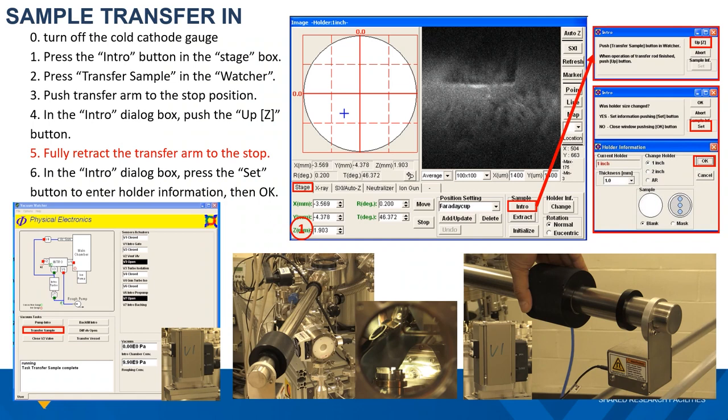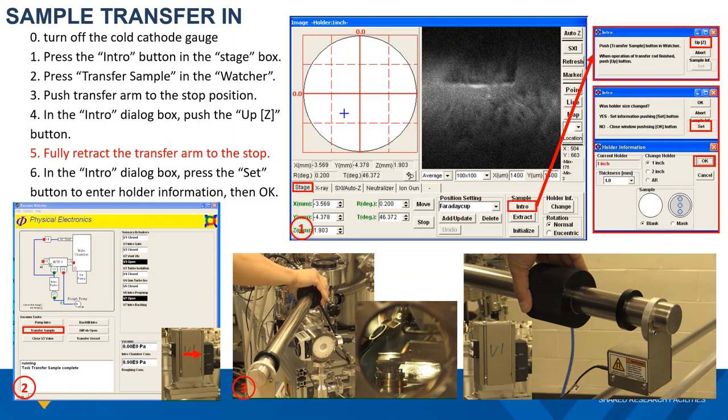Next, go to the vacuum watcher panel and click the transfer sample button. This will open the gate valve between the intro chamber and the main chamber, and the white mark will physically move from the closed position to the open position. Then push the sample transfer arm all the way into the main chamber until the handle reaches the stop position. After this, the sample will sit right on top of the sample stage.